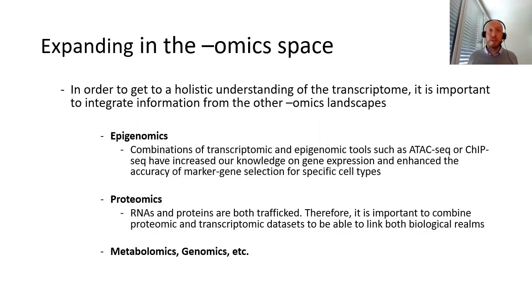And then, last but not least, we cannot regard transcriptomics as a field in itself. We know that the transcriptome is highly connected not only to the genome, but it's also the epigenome that plays a crucial part in regulating gene expression. Several studies have shown that combinations of transcriptomic and epigenomic information, such as a combination of, for example, single-cell RNA-seq with ATAC-seq and ChIP-seq, have increased our understanding of the transcriptome significantly, for instance, by facilitating our marker gene selection for individual cell types. And along the same lines, having a profound understanding of the transcriptome is crucial for a good understanding of biological processes.